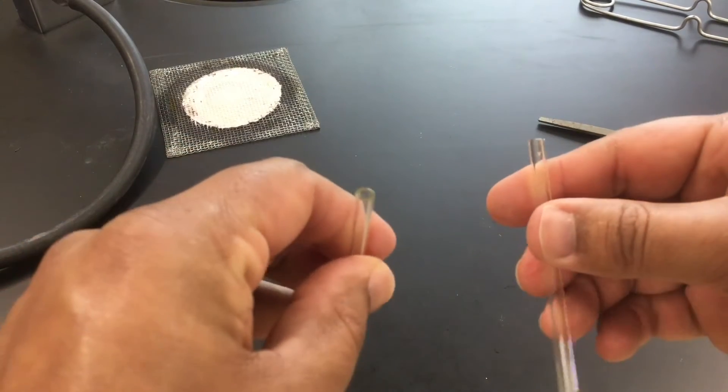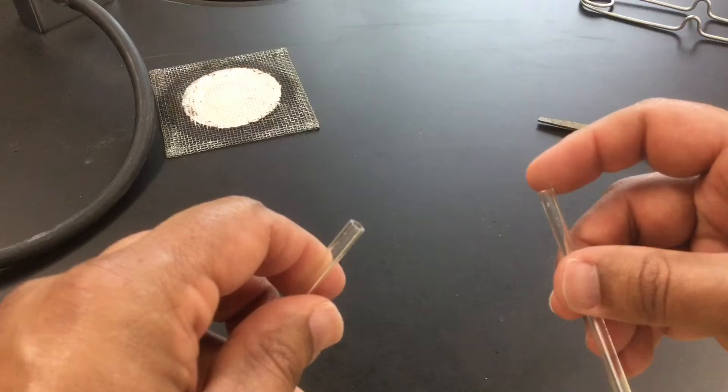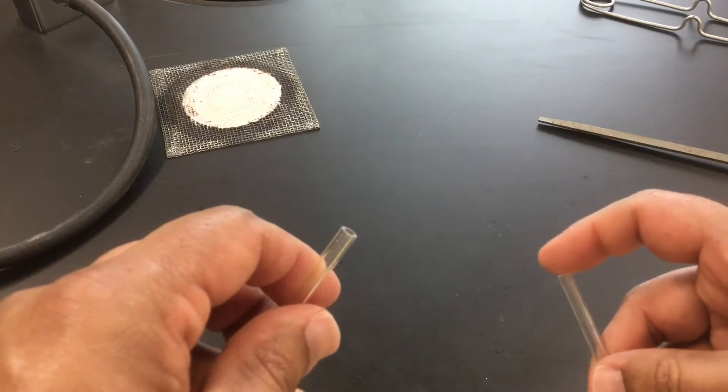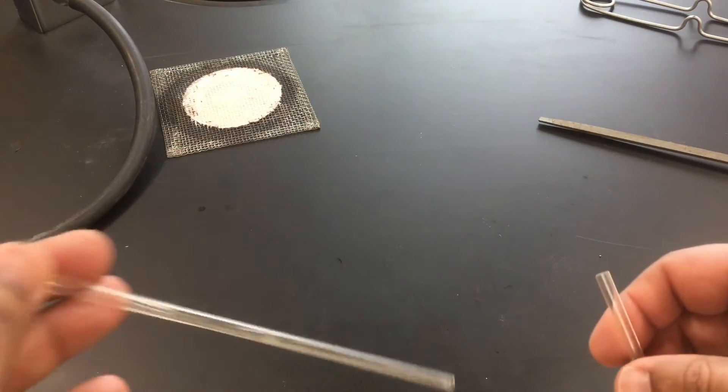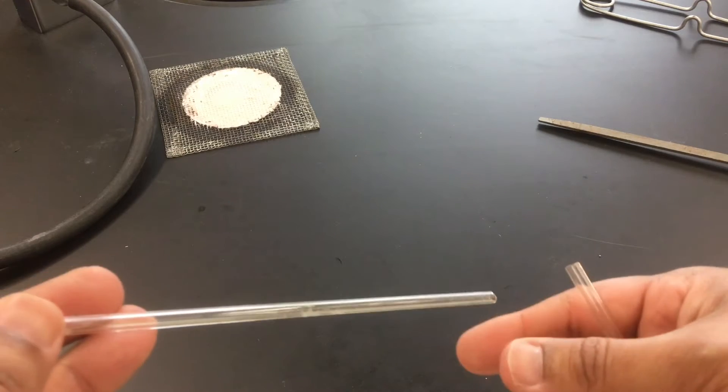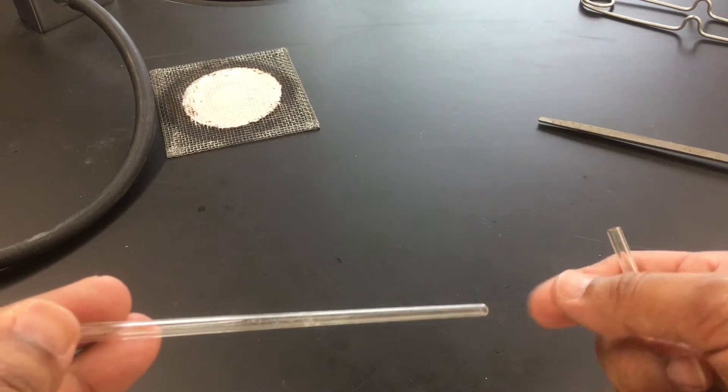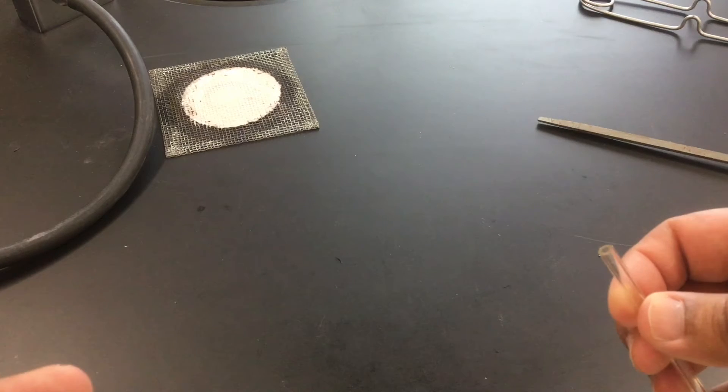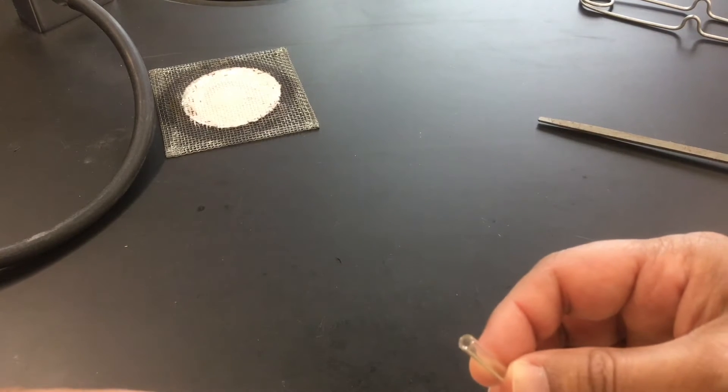Now it's not the smoothest thing in the world because if you run your finger over this you'll notice it's a little bit sharp. In fact we have two pieces of glass and both ends are rather sharp. So we're going to fire polish these pieces of glass so that they're nice and smooth.